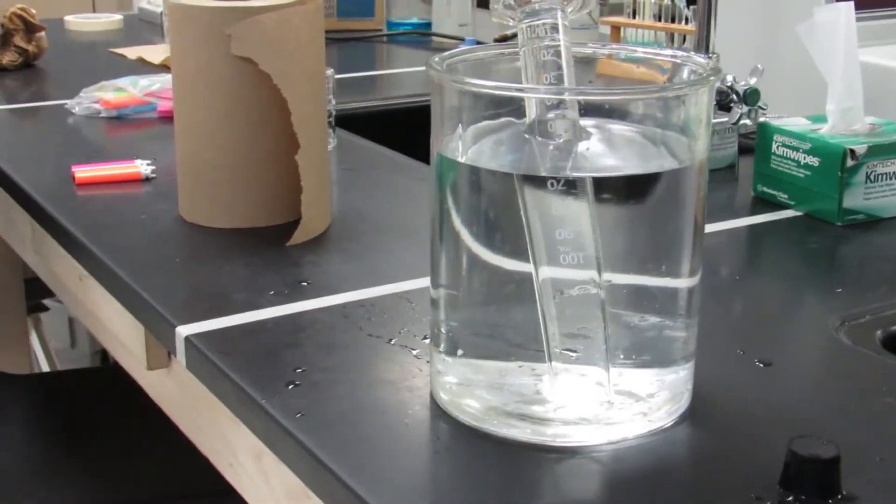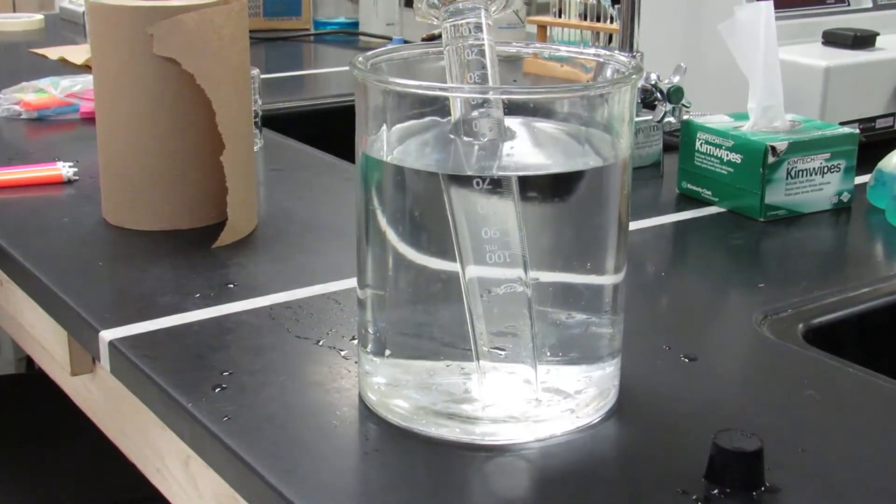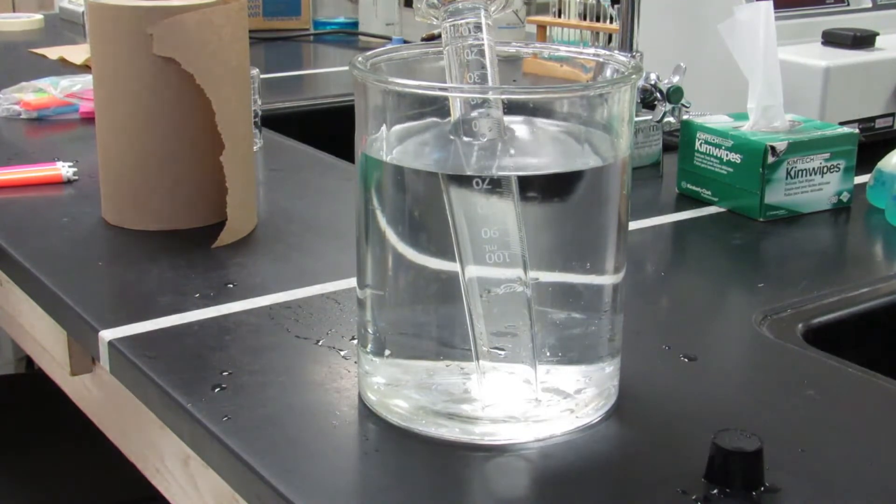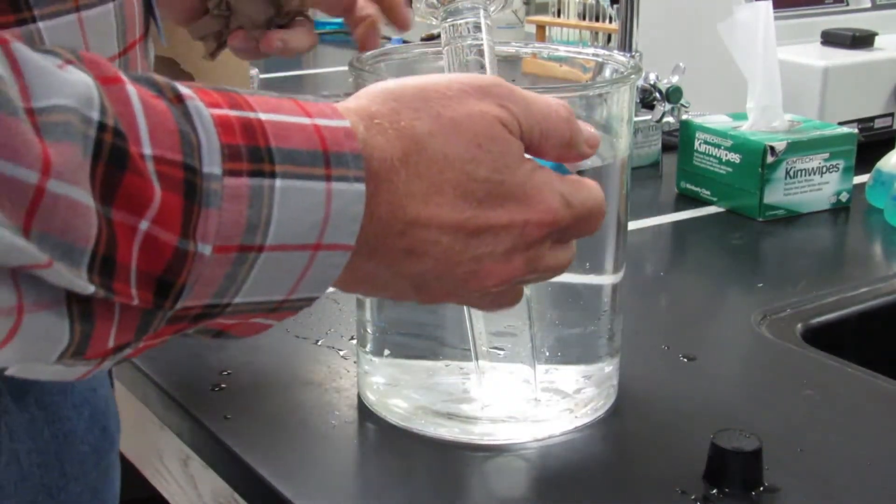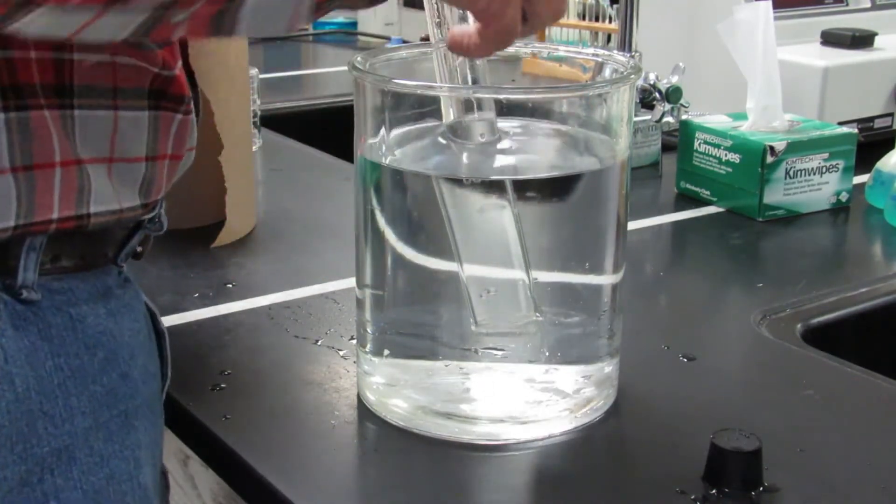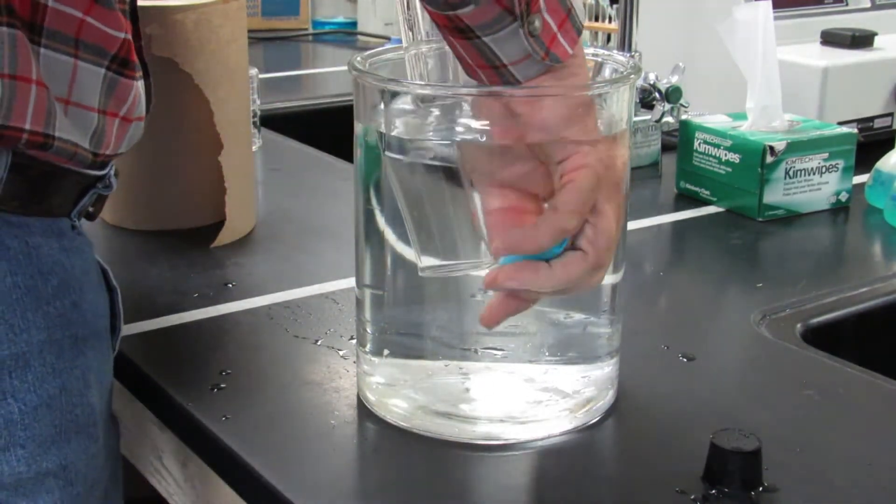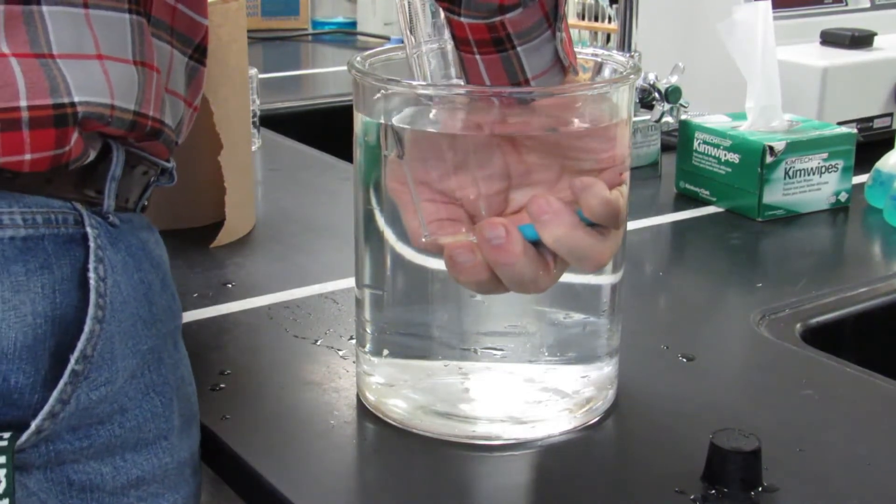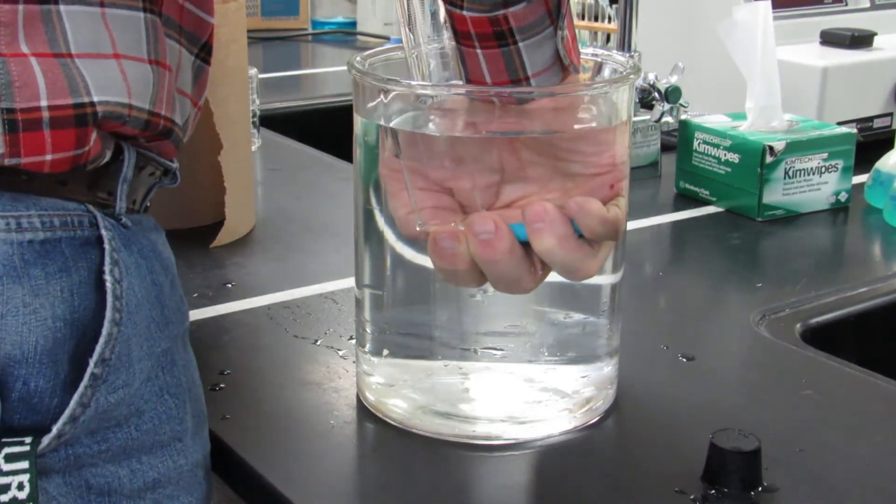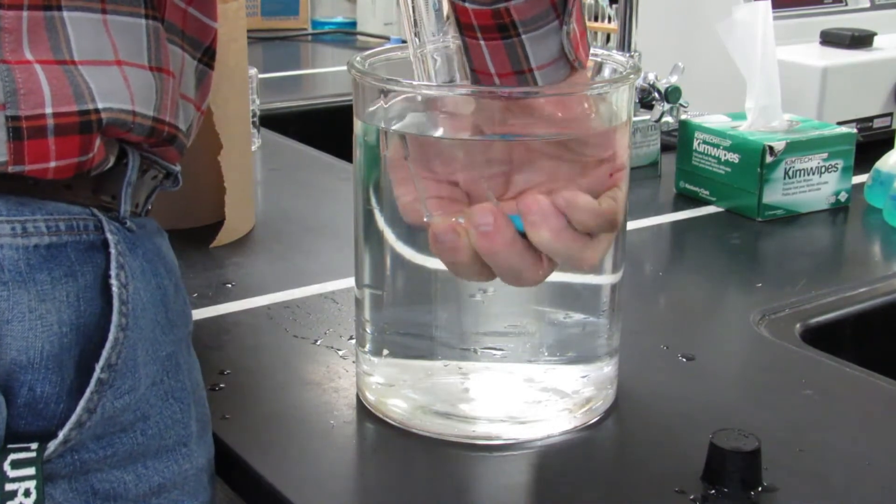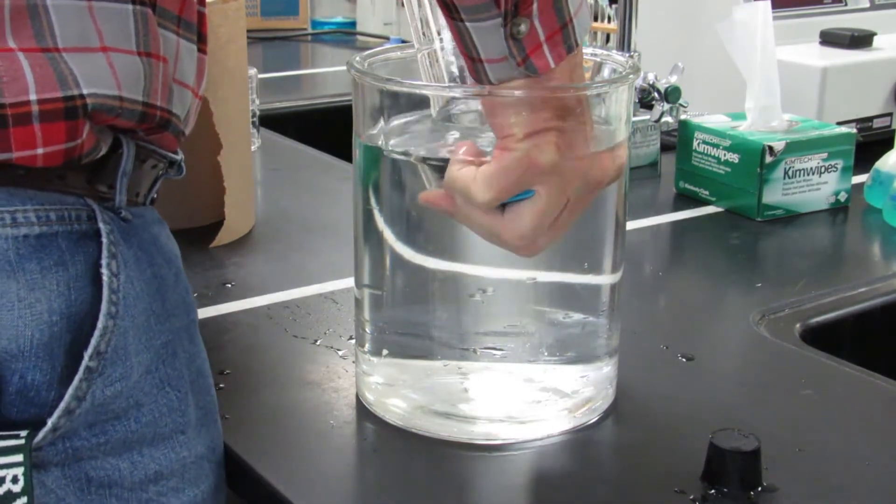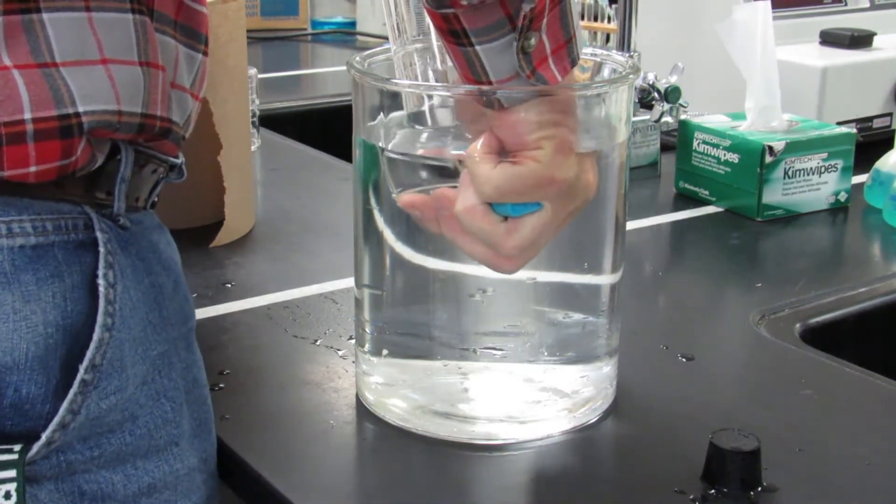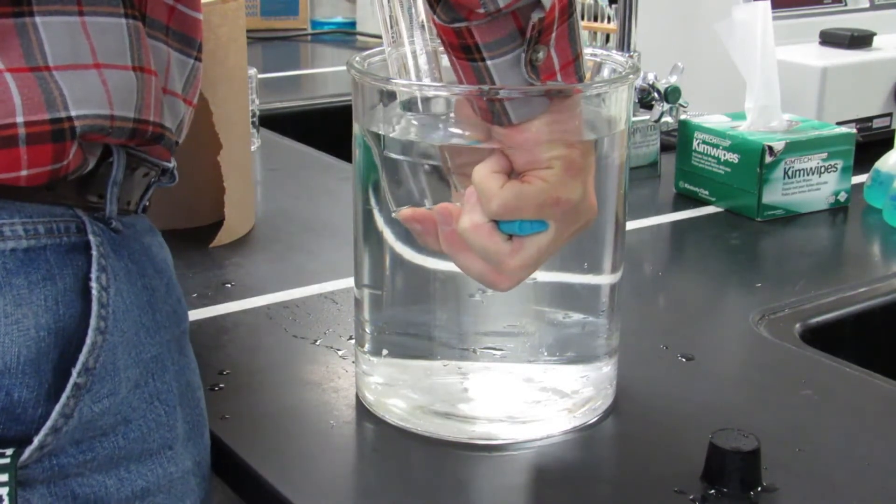Now once we've done that, we want to go ahead and dispense the butane out of the lighter into the graduated cylinder. So put your hand underneath, go ahead and press the button on the lighter. And this is not the most exciting thing in the world to watch, but it takes a long time. You allow the gas to go out.